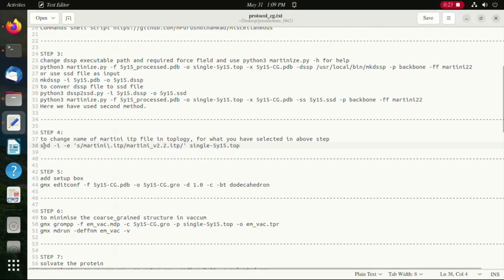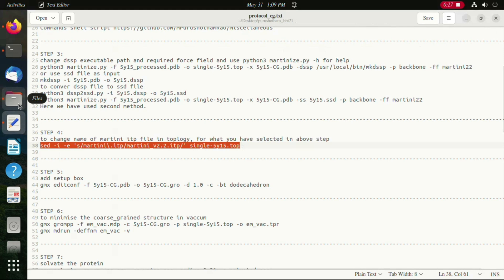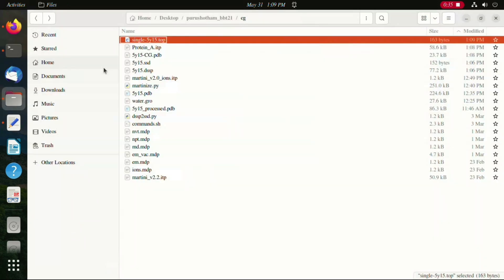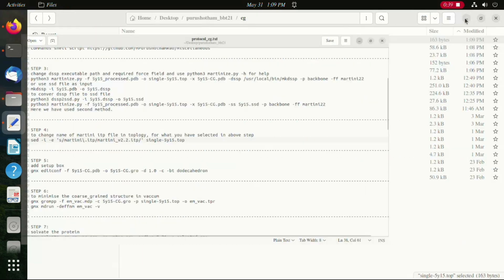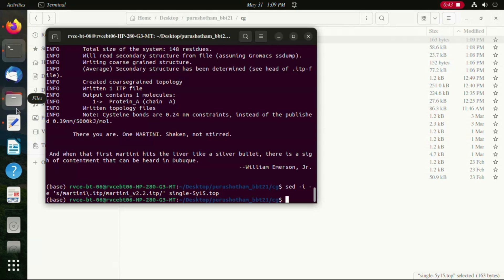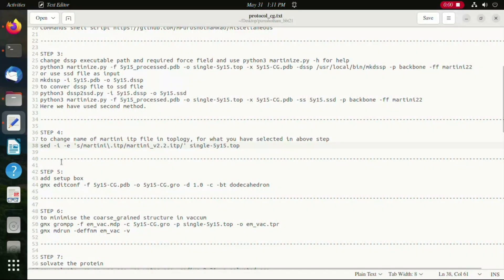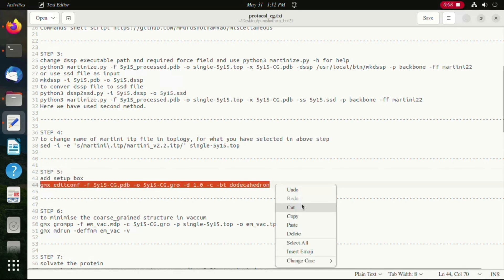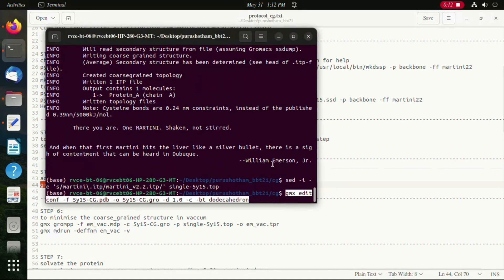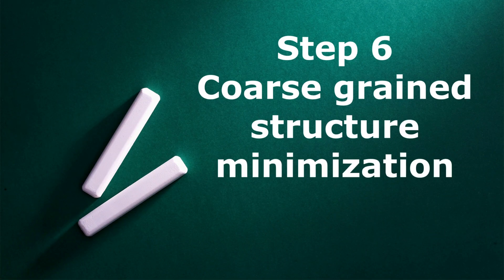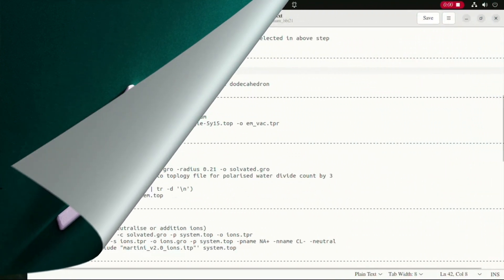Moving on to the next step, where we add the simulation box, we will use the command editconf. Moving on to the next step, we will be minimizing the coarse-grain structure in vacuum, in the absence of any solvent.